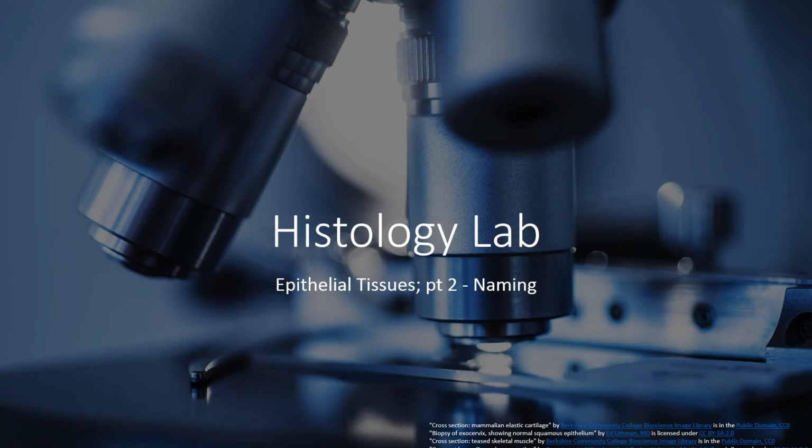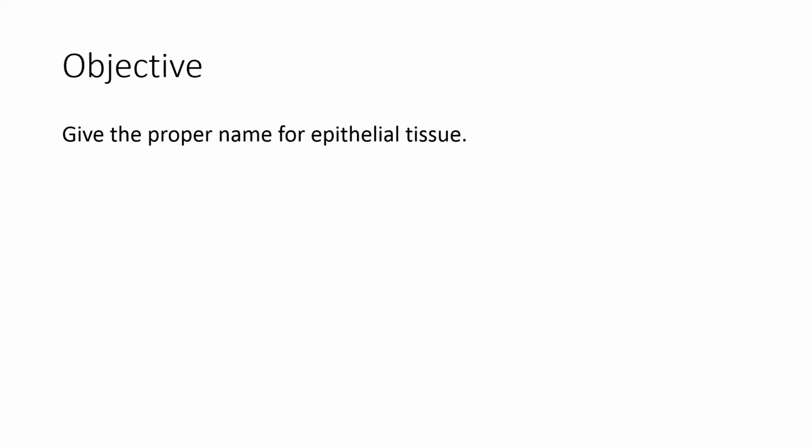In the last video on epithelial tissues, we looked at how to identify them, how to recognize them in a slide. Now that you can do that, let's talk about how to name those tissues. Our objective for this video is to be able to name epithelial tissues when we see them.